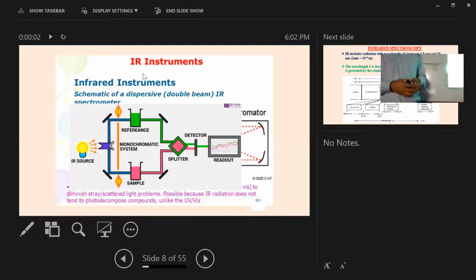So people are trying to develop the instrument in such a way that we can have a very flat line for the noise, and increase the signal as much as we can, so that it can be very good quality. So this is the signal to noise ratio. That means if the ratio of the signal and noise is very high, the instrument quality is very good. Because if you consider this is 100 and this is maybe 2, in that case 100 by 2 is 50.